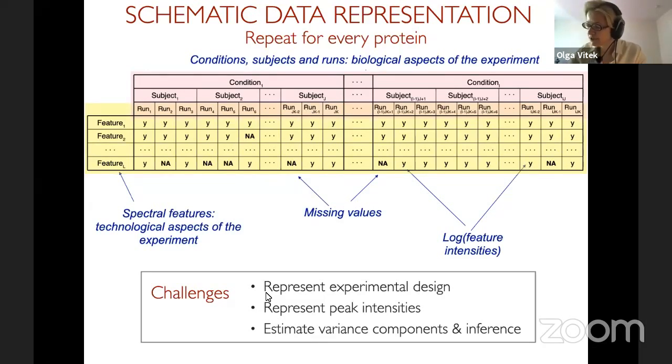Do we have a converter for PTM proteomic data? Internally, yes, but it is still under development. We're hoping to release this before the end of this year, but as of today, it's not quite ready yet.